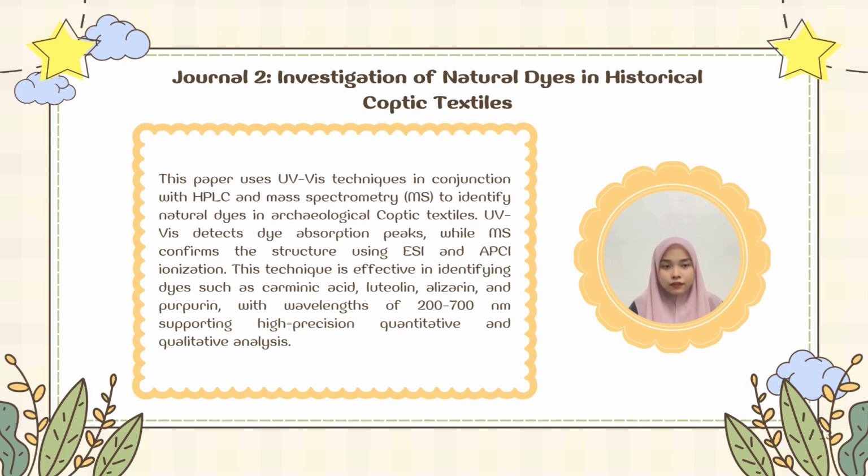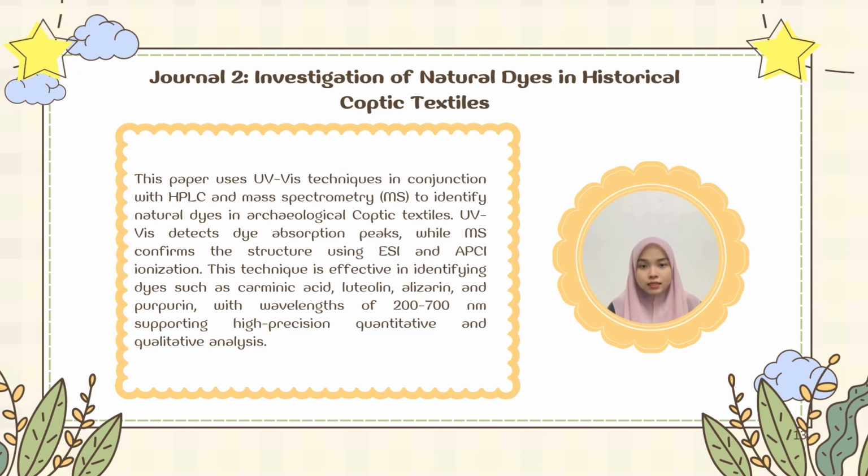This technique is effective in identifying dyes such as carminic acid, luteolin, alizarin, and purpurin with wavelengths of 200 to 700 nanometers, supporting high precision quantitative and qualitative analysis.